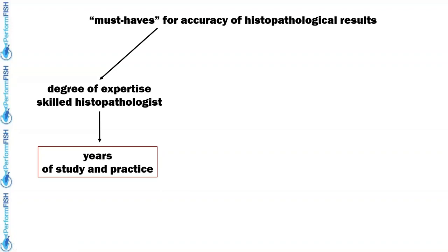Furthermore, to avoid misinterpretation, and most of all misdiagnosis, is indispensable to obtain correct data. Misdiagnosis occurs when a morphological observation is incorrectly considered abnormal, or when inaccurate or imprecise terminology is used to describe a particular morphological observation.